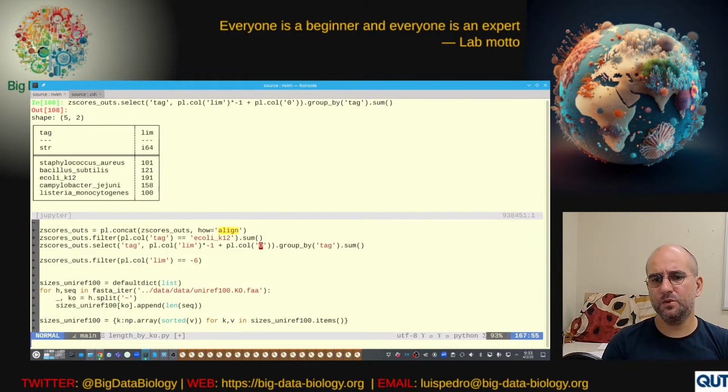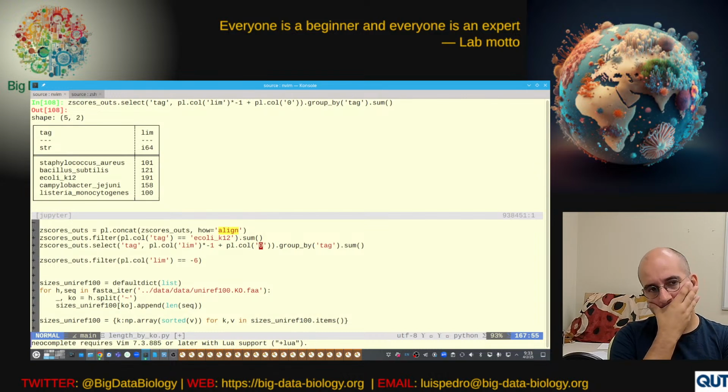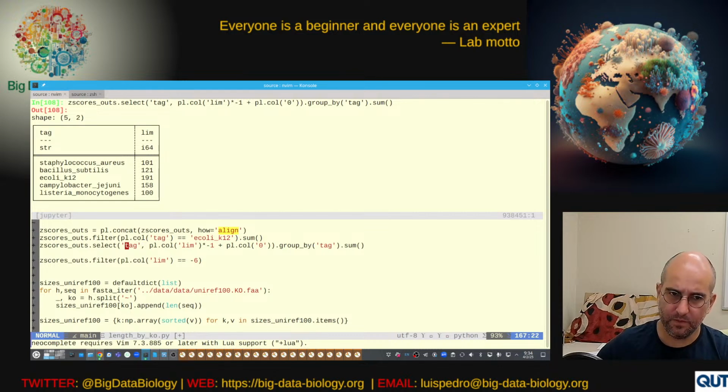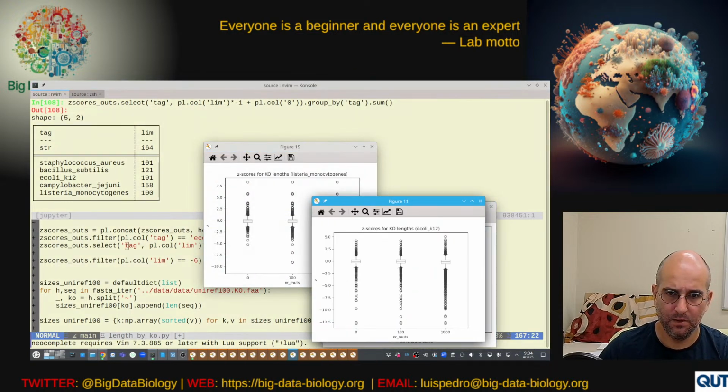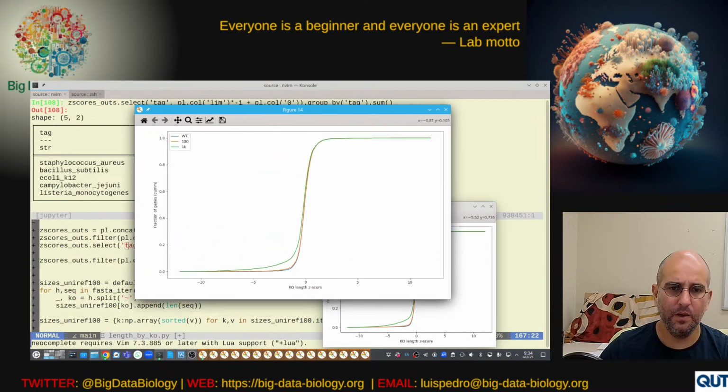The other way we could do it is a little bit what CheckM2 actually does itself, which is we take this as input data and then we learn the model. Okay, this is pretty terrible. What we're talking about here is, right, this was a pretty hacky version of doing the integration, so the area under the curve on this side.